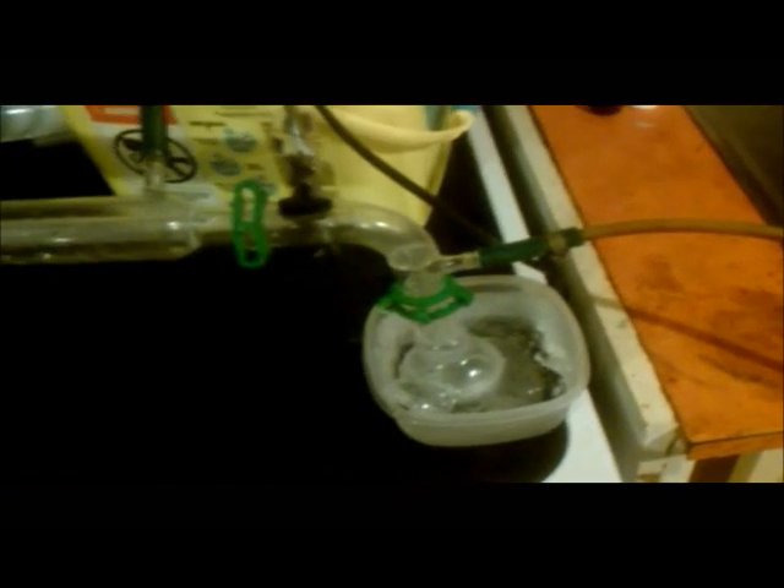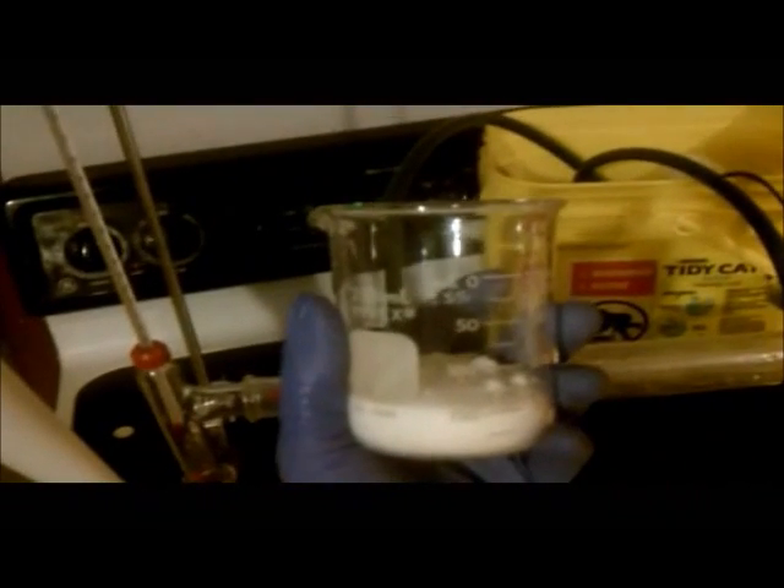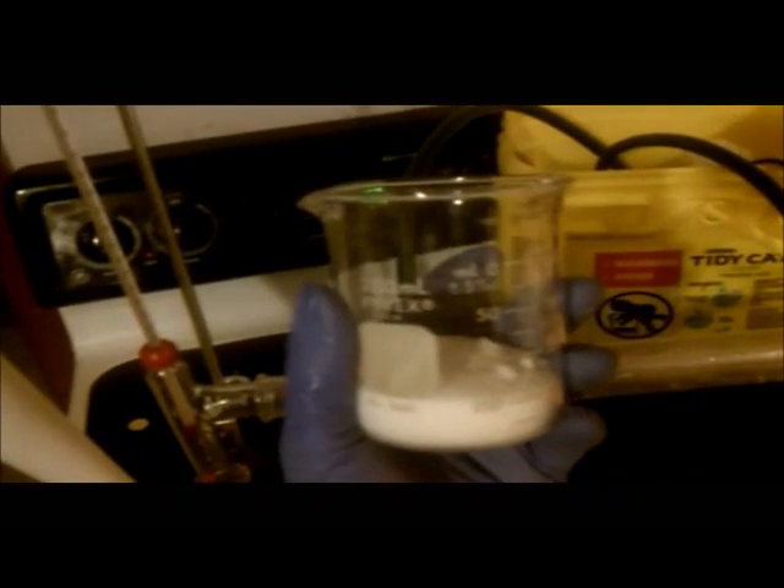The water should also help to absorb any hydrogen bromide gas that might come over, and any that's not absorbed will be vented out this hole out the window. I have 120 grams of sodium bromide, and I'm going to be adding this to my reaction vessel.